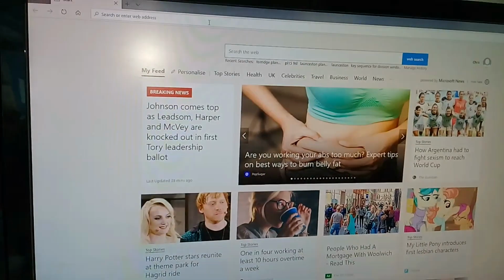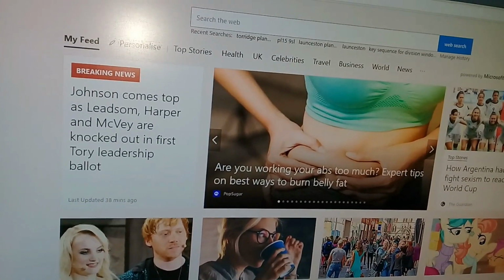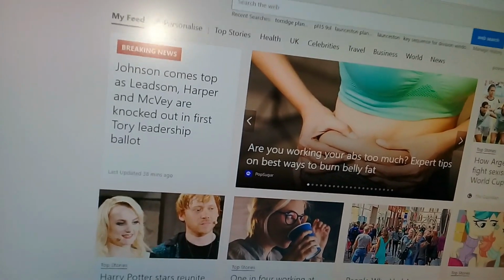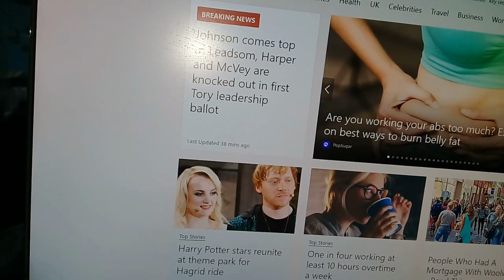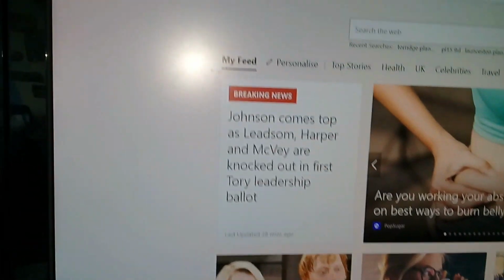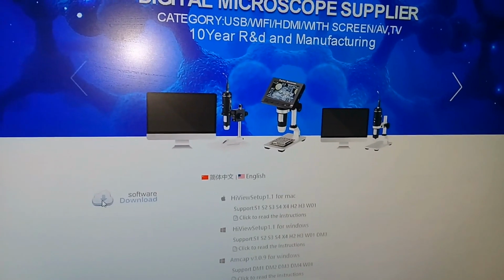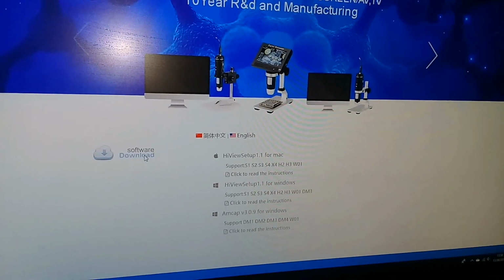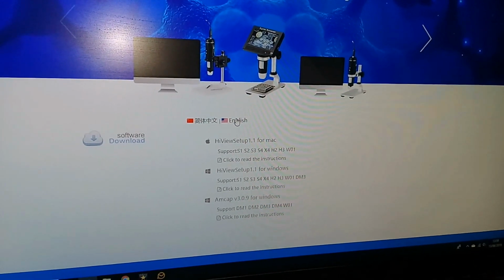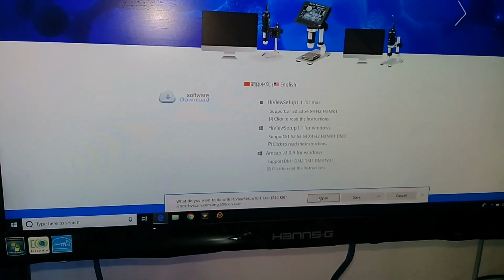This is fired up, so let's have a look. Alright, so here we go. Let's go to this URL. Kind of need the microscope to read the actual text. soft.hvscam.com. Whoa, look at this. Digital microscope supplier. Let's go software download. Doesn't seem to be doing much. English. That's the latest one. Let's go that one. Open.